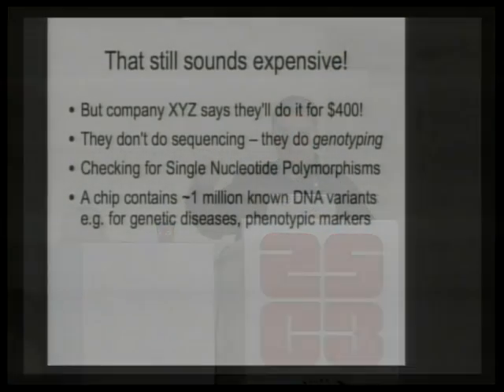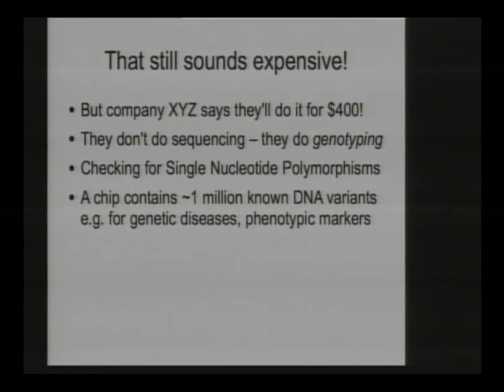And there are chips, not computer chips, they're glass chips, and companies can prefix this position, a copy of this position, and the surrounding genomic region, like a few dozen bases in either direction, on this chip. And they do one with the so-called normal variation and one with the alternate variation.